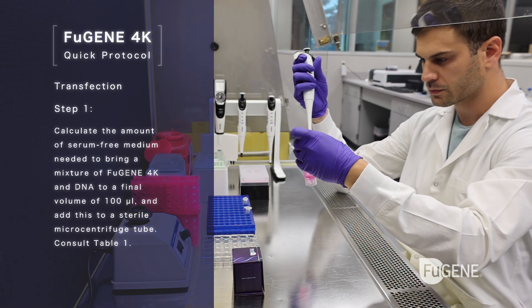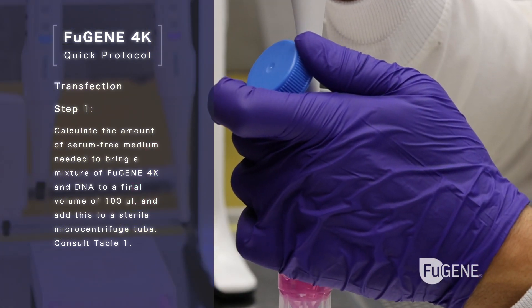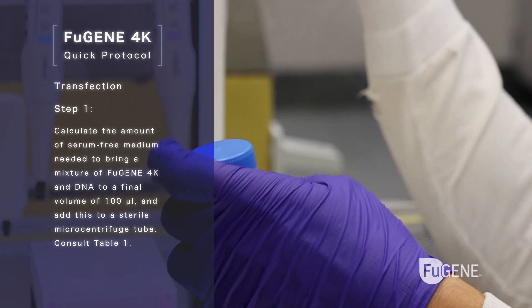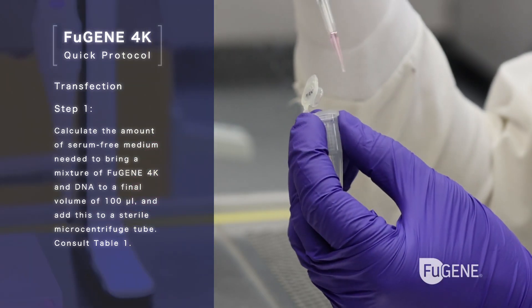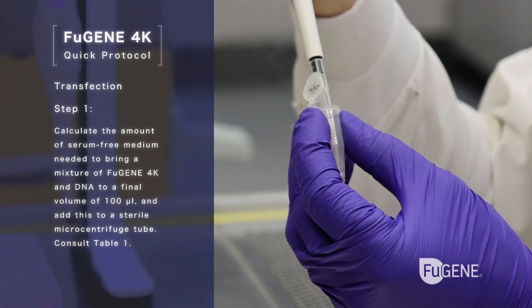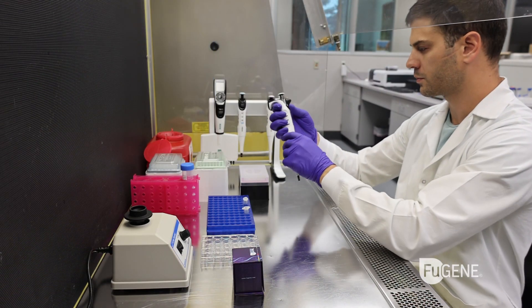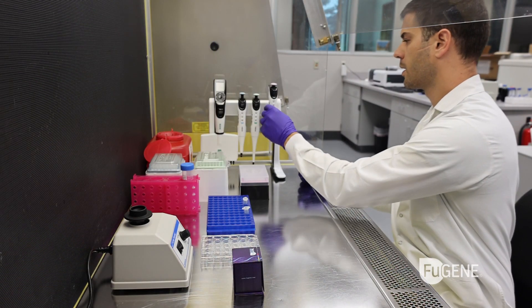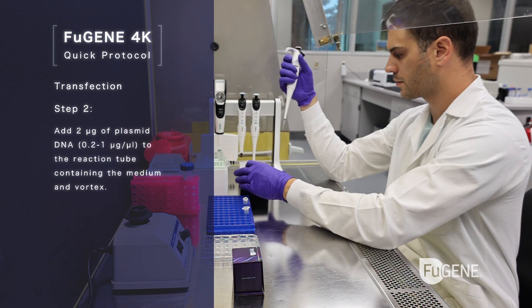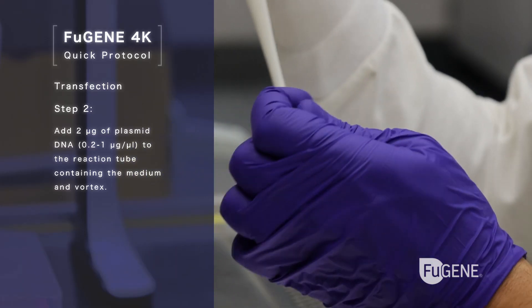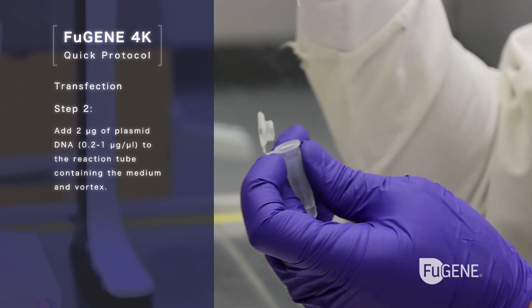Transfection step 1: calculate the amount of serum-free medium needed to bring a mixture of FuGENE 4K and DNA to a final volume of 100 microliters, and add this to a sterile microcentrifuge tube — consult table 1. Step 2: add 2 micrograms of plasmid DNA (0.2 to 1 microgram per microliter) to the reaction tube containing the medium and vortex.